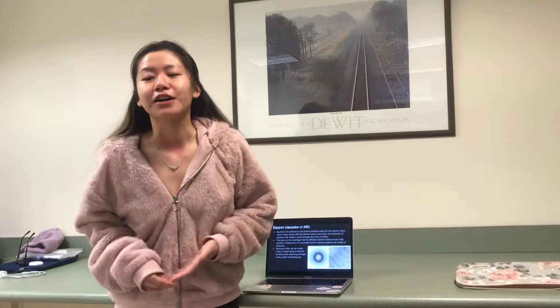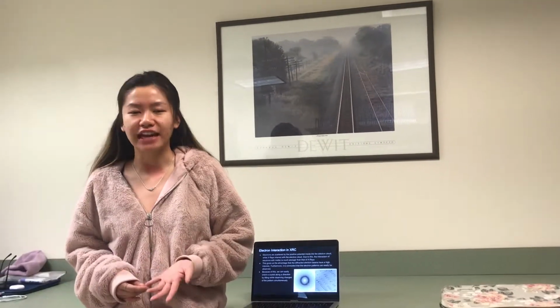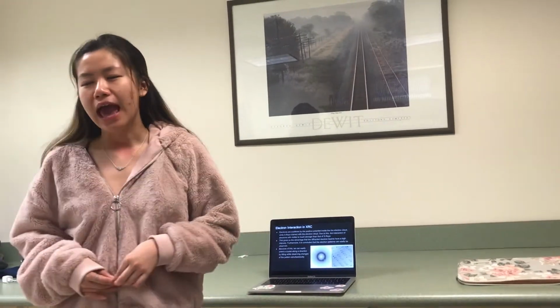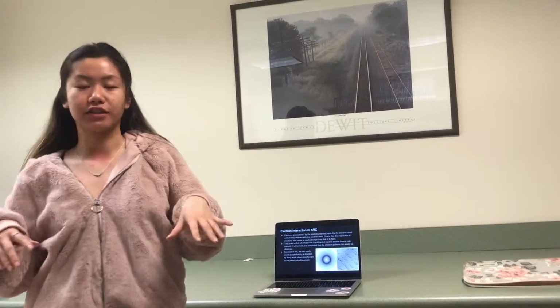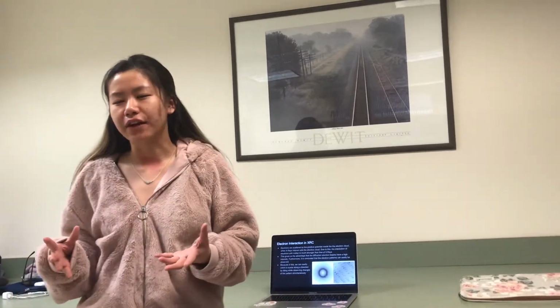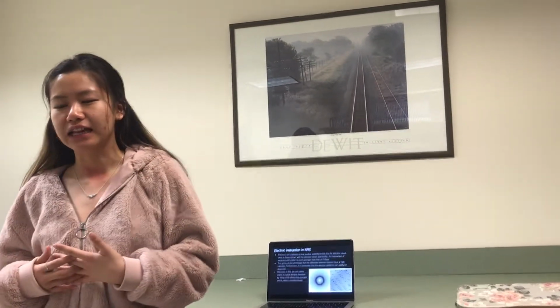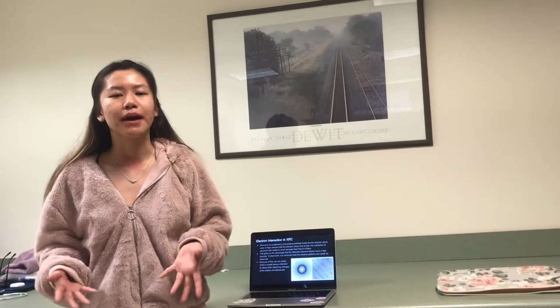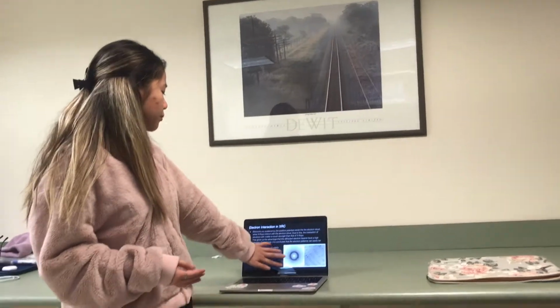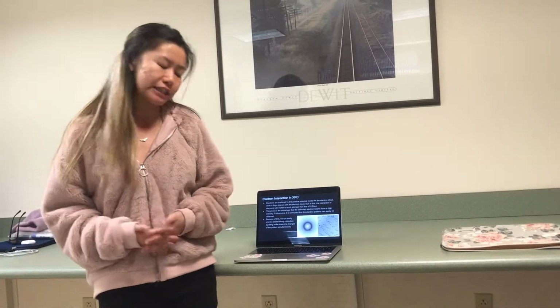So specifically, we wanted to talk about the electron interaction in X-ray crystallography. Since electrons have a negative charge, they will be pulled by the positive charge of the electron cloud. And while X-rays are interacting with the electron cloud, we know that the electrons will have a stronger interaction compared to the X-rays. This gives us the idea that it will give us a high intensity, specifically in the electron pattern when we look at the diagram. As you can see here, this is what we will see if we look at the photographic film or anything like that using our technology with the XRC.